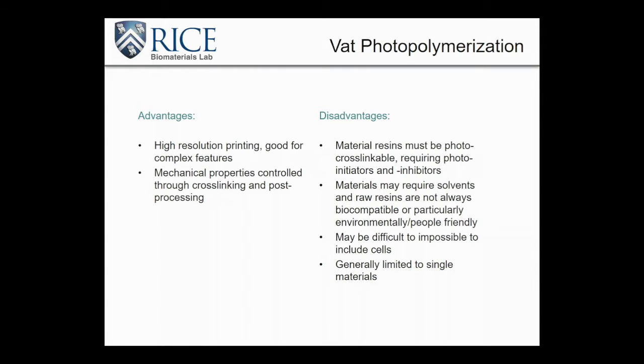and rest assured that you can get the microarchitecture in this printing methodology that you can't get with inkjet or with extrusion printing. Of course, like I said, the biggest disadvantage is that your material has to be photo cross-linkable. That's going to drastically limit your material choices, and the materials you use might even require solvents, which again makes things more complex when you're considering your biological interactions. And depending on the material you use, as well as the photo initiator, you may prohibit yourself from being able to use cells directly in your print.